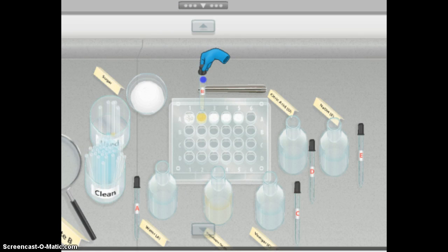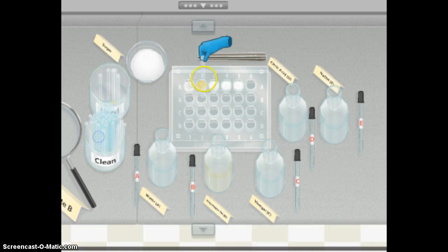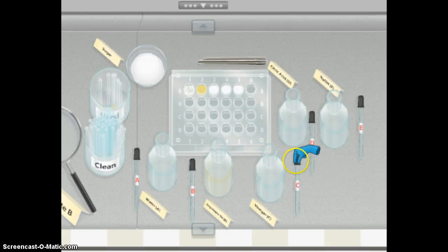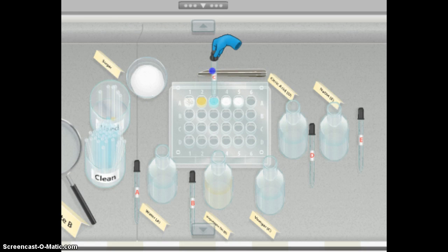And we'll go ahead and do the vegetable oil. And the reason they use vegetable oil is because oil has very different properties than the water. Remember from our chromatography lab how different it reacted on the paper as far as it being a mobile solvent and that it didn't spread the ink out very much. So oil and water have very different properties, which again, I'm sure you knew from real life. And in chemistry, we take advantage of that to get different reactions.